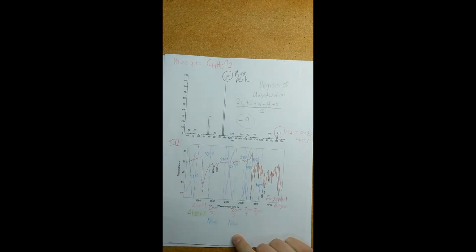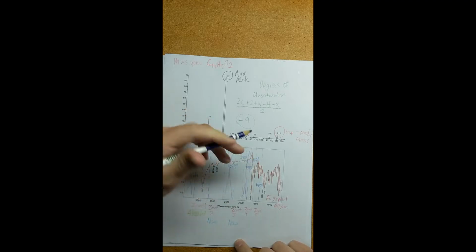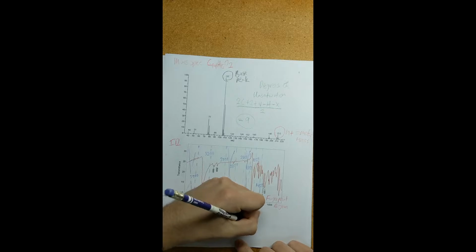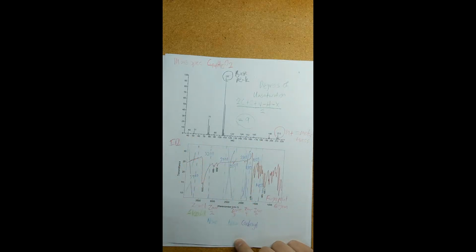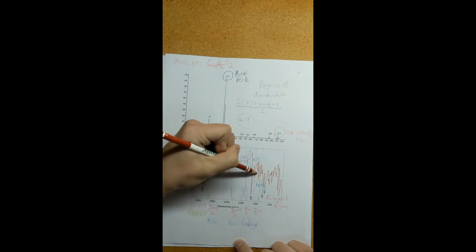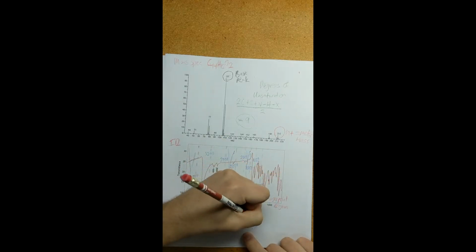In zone 4, on the other hand, we have a very, very strong peak at 1677, and in this zone that represents a carbonyl, and in zone 5 we also have a slight peak. It is not numbered, but we can still see it coming down right about here, and that's going to hint towards an aromatic.